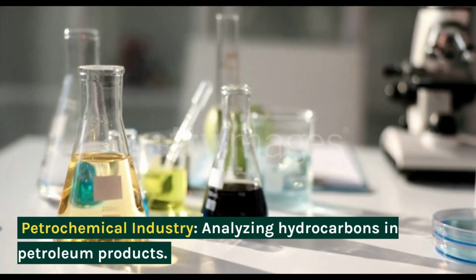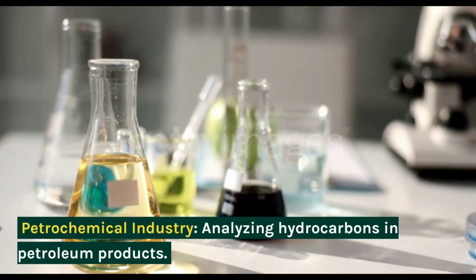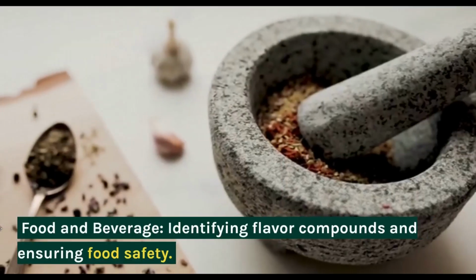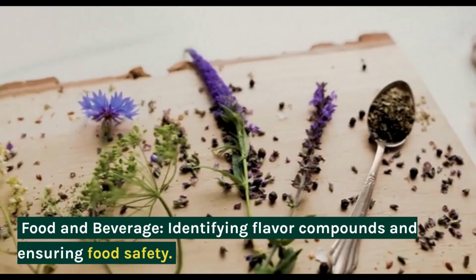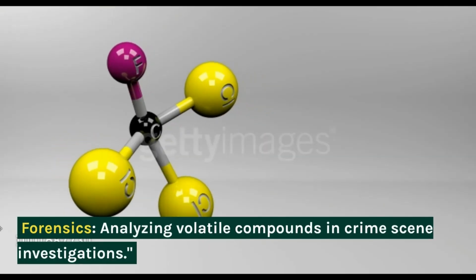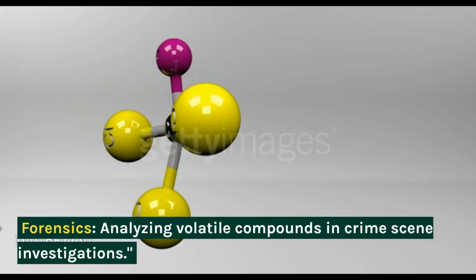Petrochemical industry, analyzing hydrocarbons in petroleum products. Food and beverage, identifying flavor compounds and ensuring food safety. Forensics, analyzing volatile compounds in crime scene investigations.